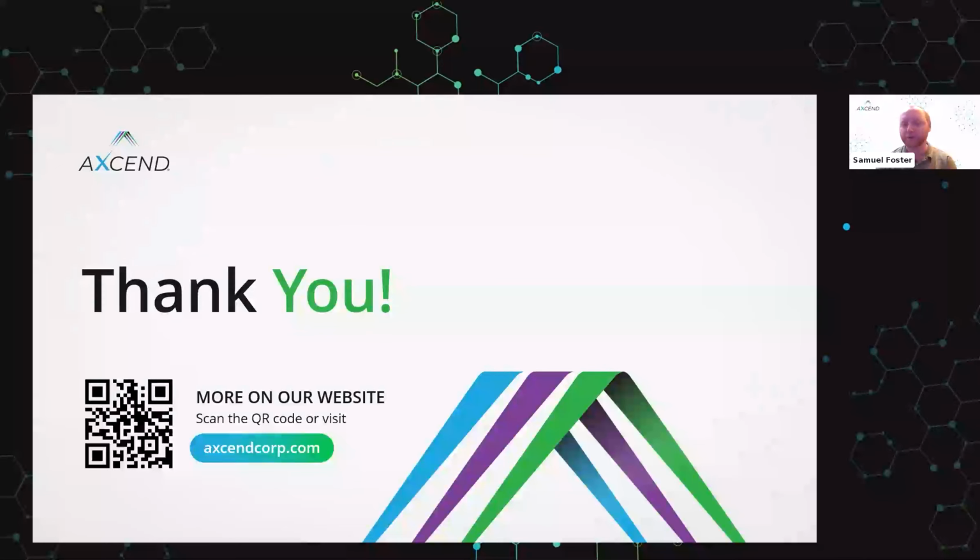So the higher you go in flow rate, typically the larger ID tubing you can tolerate. We have a paper that I believe specified the cutoff limit as below 5 microliters a minute. You want to be at about 25 micron ID tubing, and above 5 microliters a minute, you want to be at 50 micron ID tubing. That being said, that's kind of more general practice.